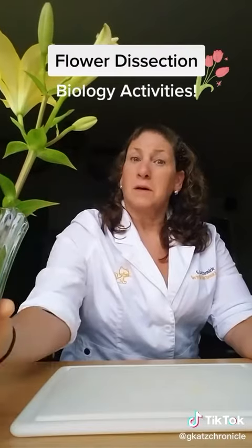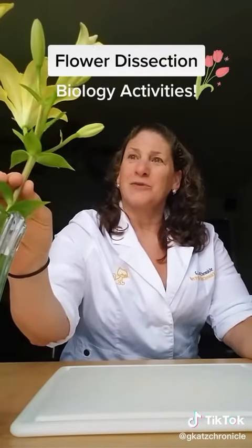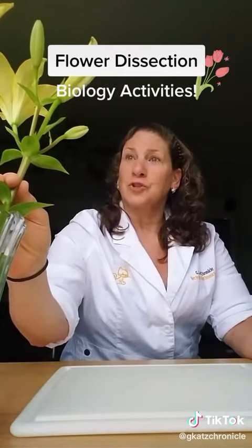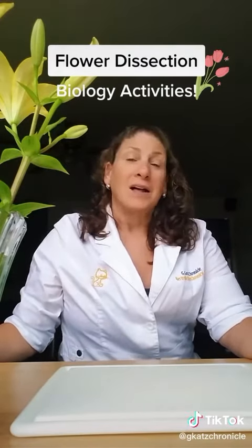I have before me some lilies. One wonderful activity that you can do at home or at school is to dissect these types of flowers, especially in a reproduction unit. Lilies work the best. There's a couple of others that you could probably get your hands on. Daffodils, alstroemeria, tulips, and gladiolas also work well.